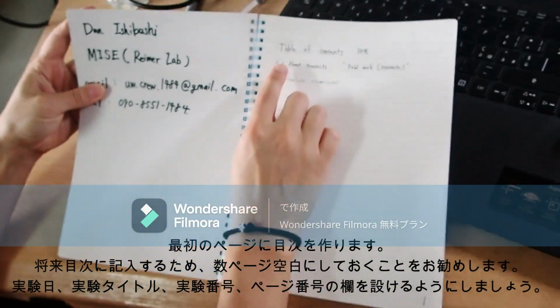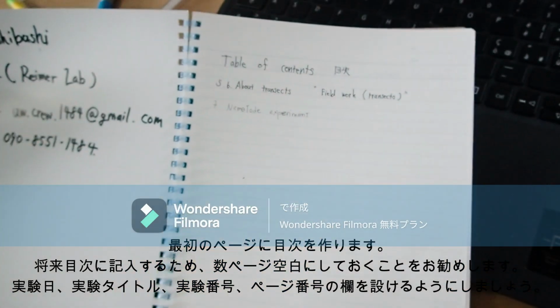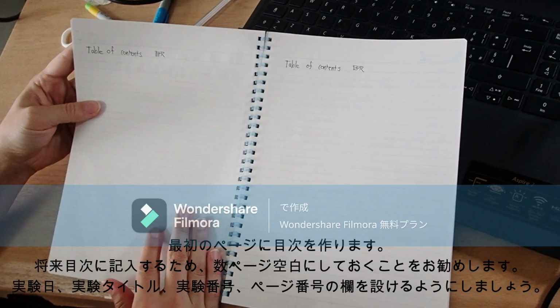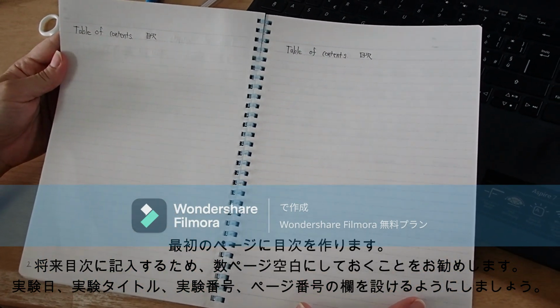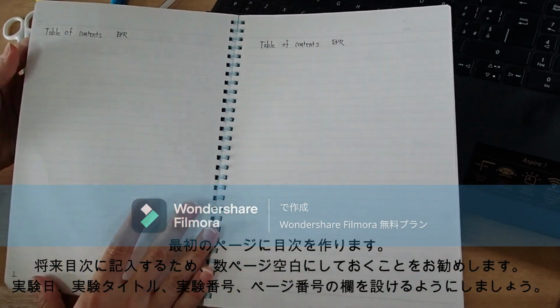Create a table of contents on the first page where you can write all the contents of the notebook. Leave a few pages blank for the future entries in the table of contents. You can also include columns for the date of the experiment, the experiment title or experiment number, and the number of pages there.